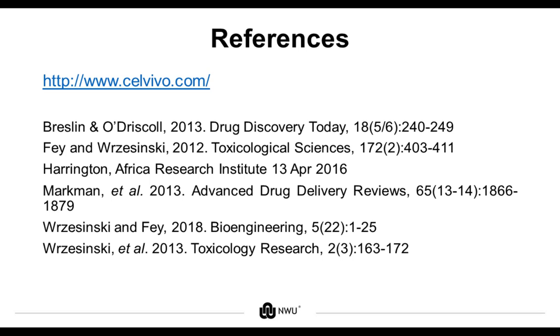So let's go to our next one. How will you measure the stability of your drug resistance in your spheroid models for the duration of your experiments? As I've already mentioned, during characterization, we do continuous sampling for the gene expression to determine if there are any possible changes in our gene expression profile. During the experiments, we will also determine the gene expression weekly, and then you can evaluate the changes induced by your specific drug treatment.